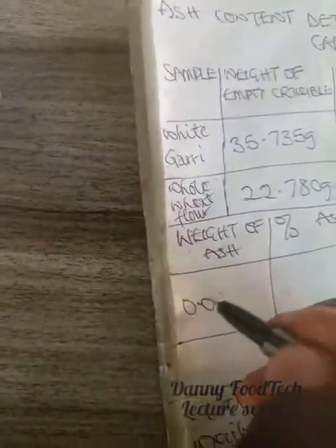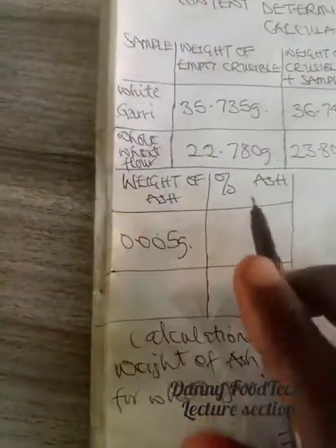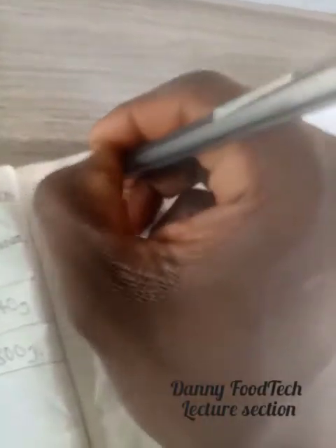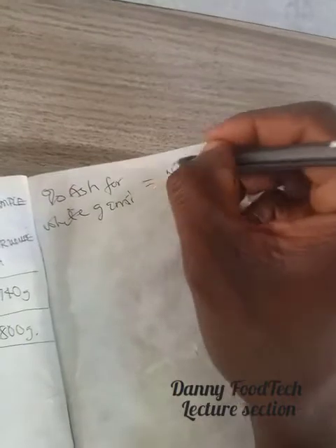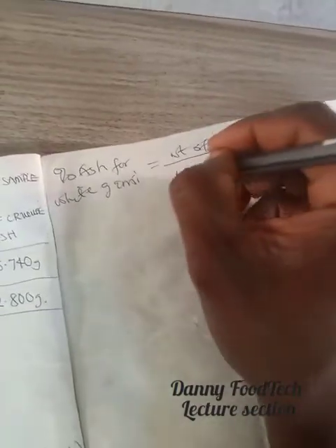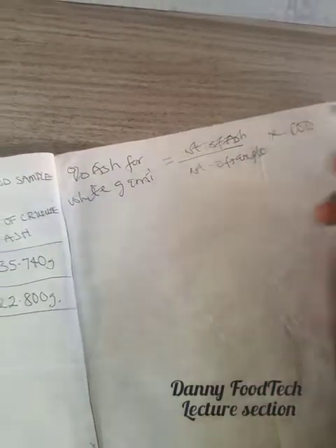Why are we calculating the weight of ash? The reason is that to calculate the percentage ash for white Gary, it is equal to the weight of ash over the weight of sample, times 100.